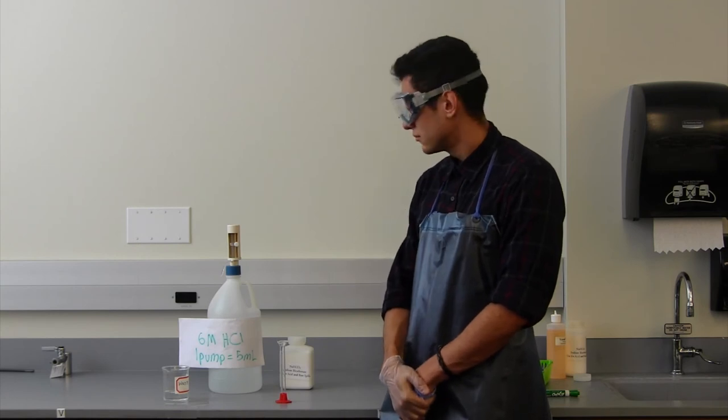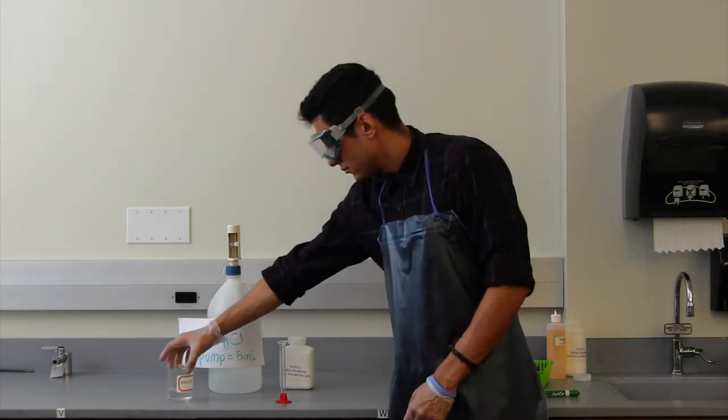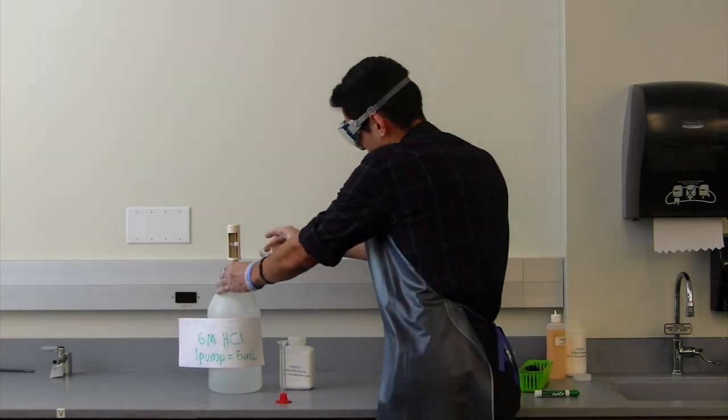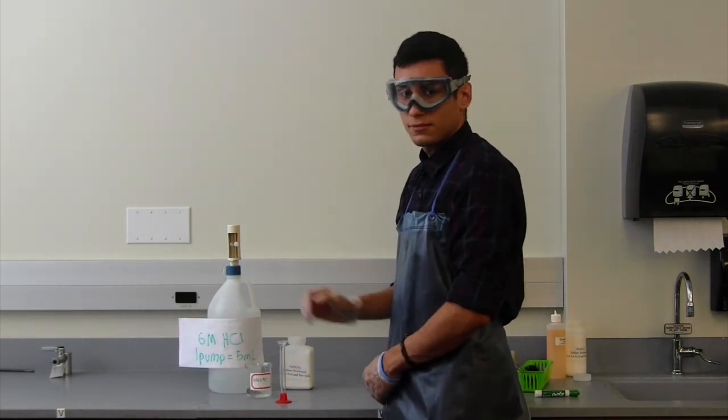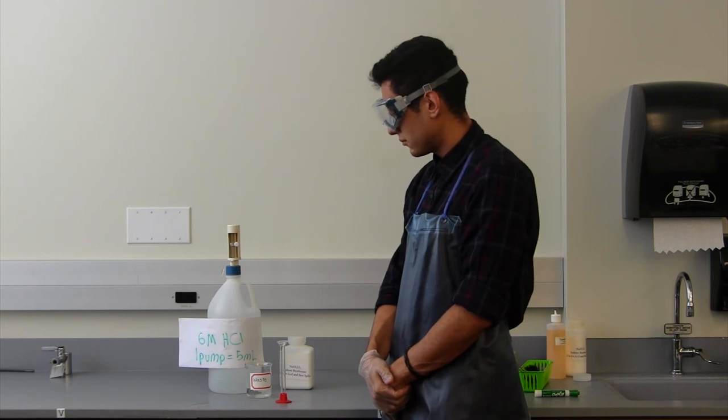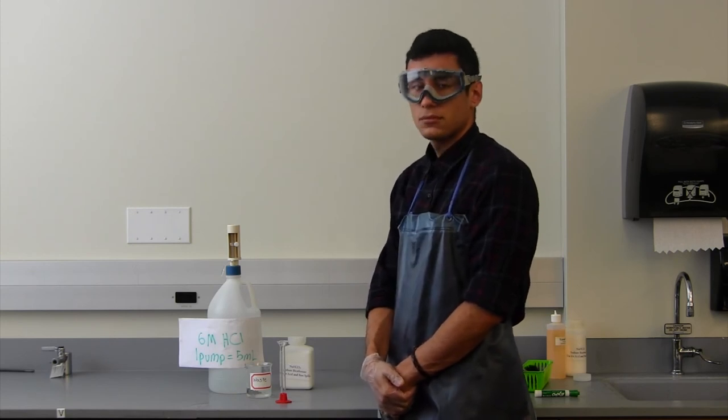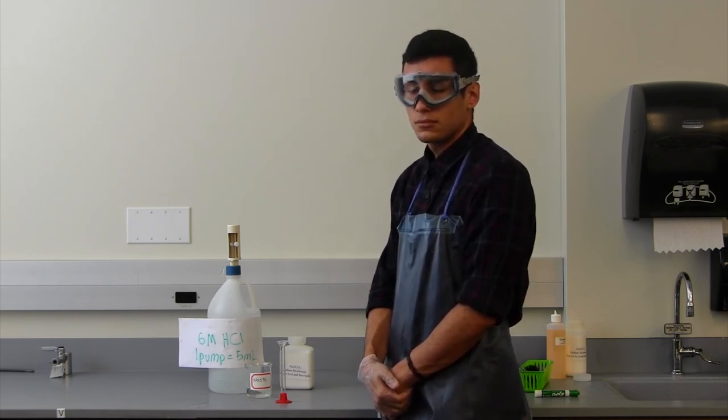Another mistake regularly performed by eager general chemistry students is pouring any excess reagent back into the reservoir or down the drain. Pouring excess reagent back into the reservoir can easily cause contamination, and we want to avoid it.